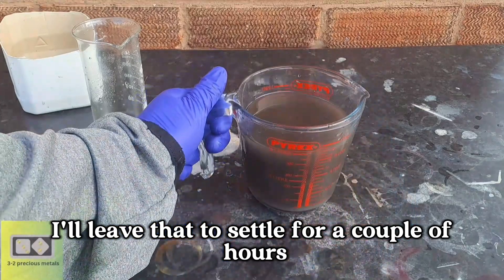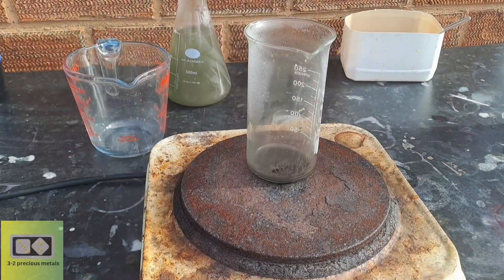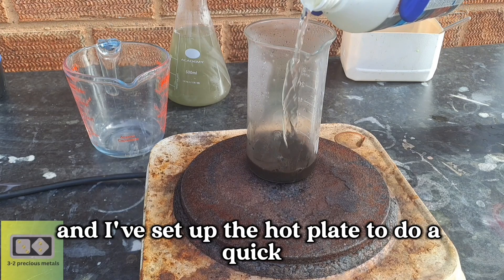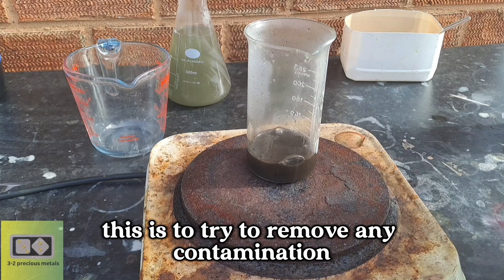I'll leave that to settle for a couple of hours. After allowing the gold dust to settle, I decanted the solution into the flask at the back of the counter, and I've set up the hot plate to do a quick hydrochloric acid boil to try to remove any contamination.